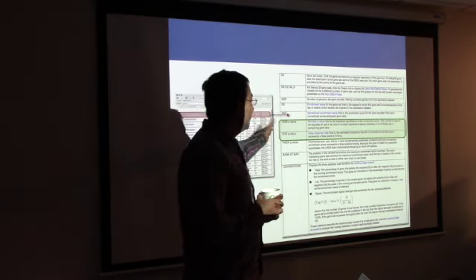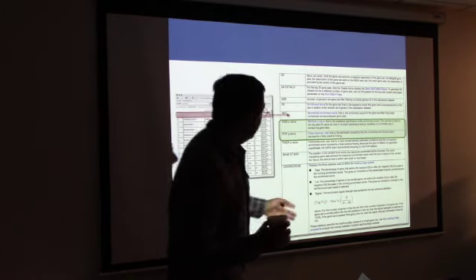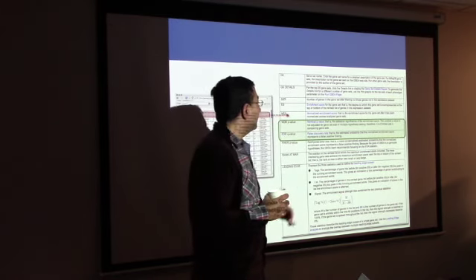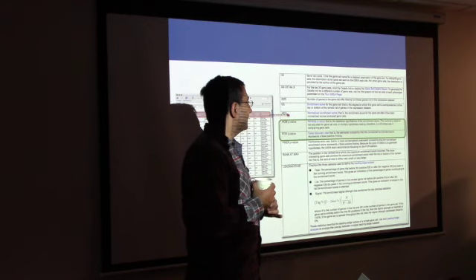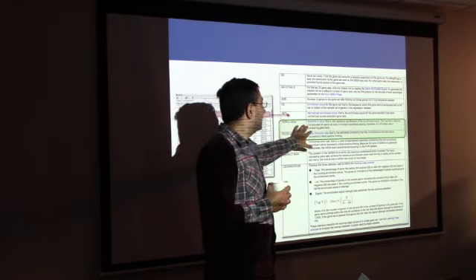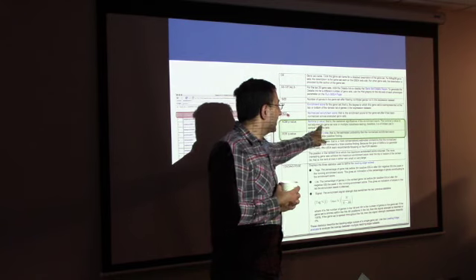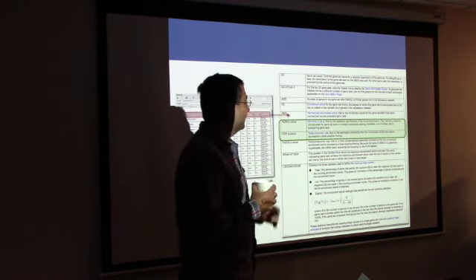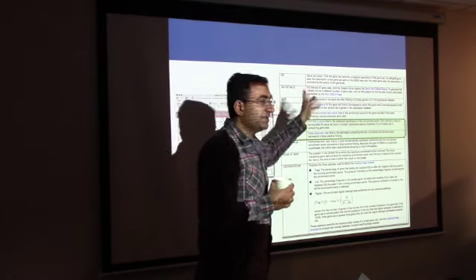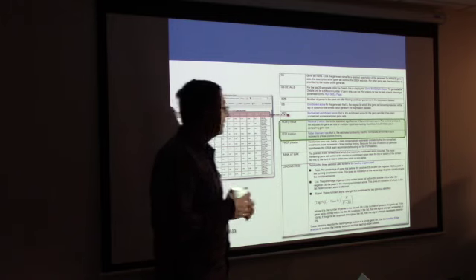So here are some other things. This slide is from the Broad's website. But basically, apart from the enrichment score, which is here, we also want to look at the nominal p-value. This is the statistical significance of the enrichment score, but this is not adjusted for gene set size. So again, take this with a grain of salt, that this is not adjusted. Therefore, it is of very limited use in comparing different gene sets to each other. Okay. All right.